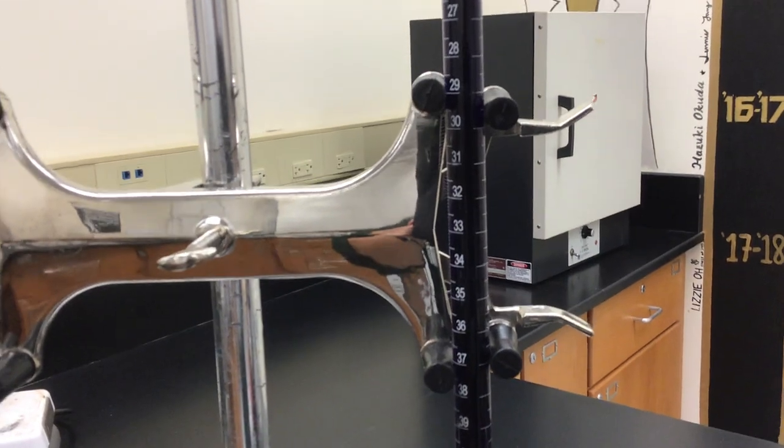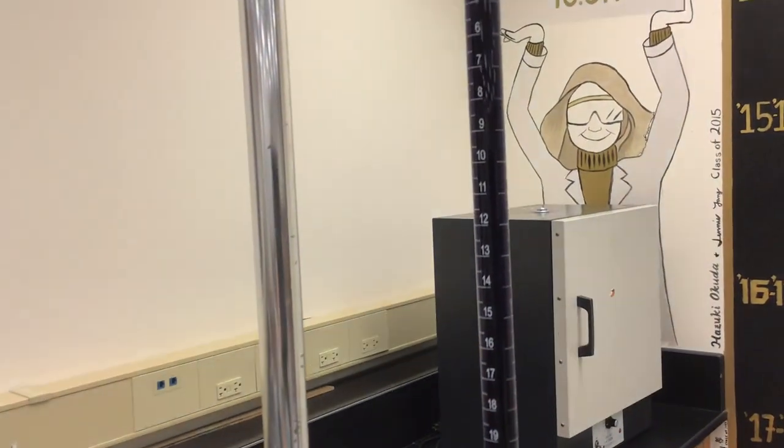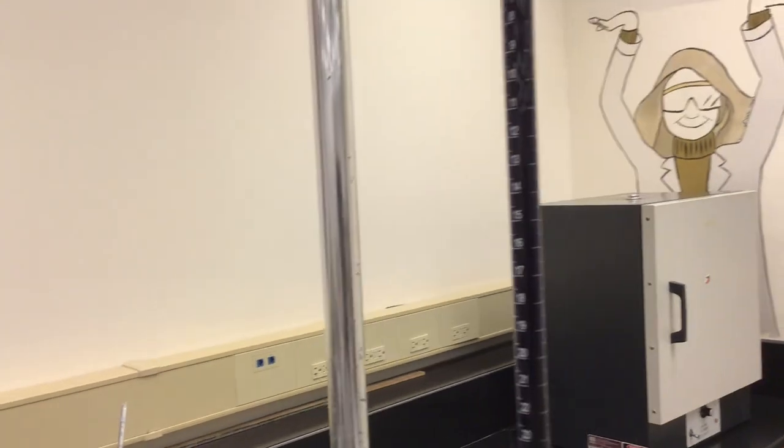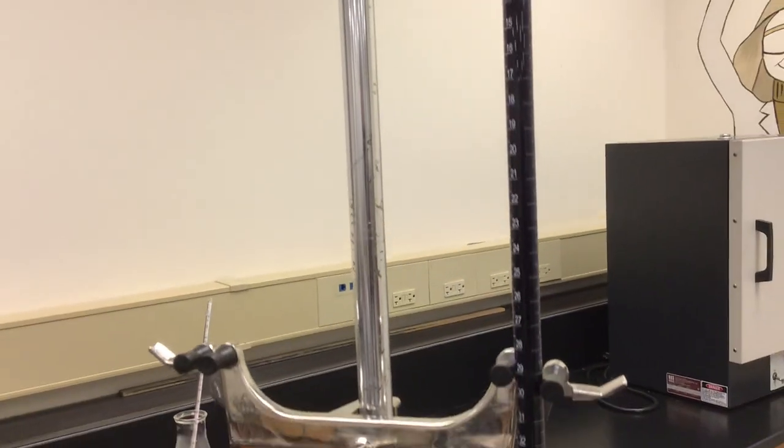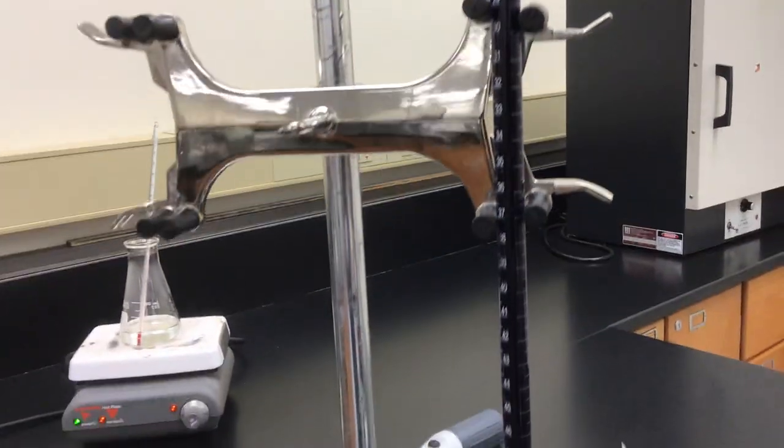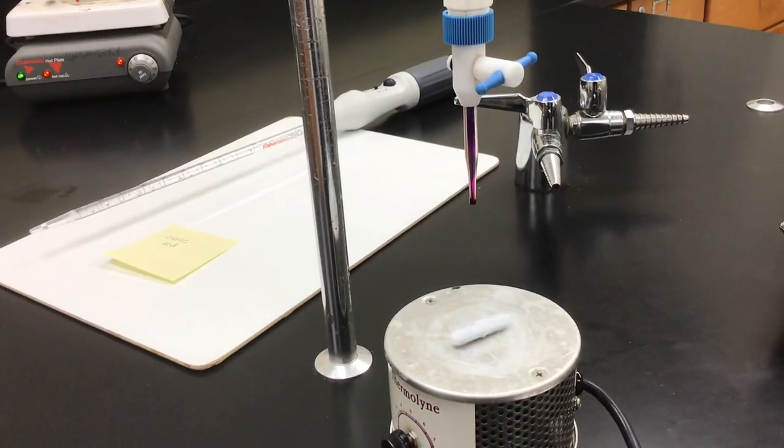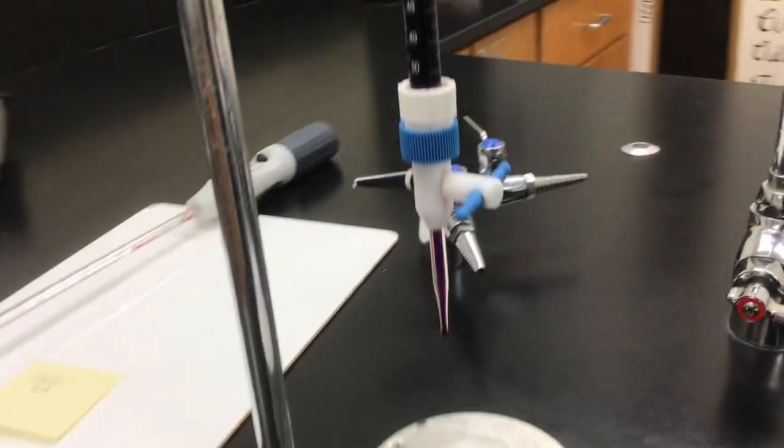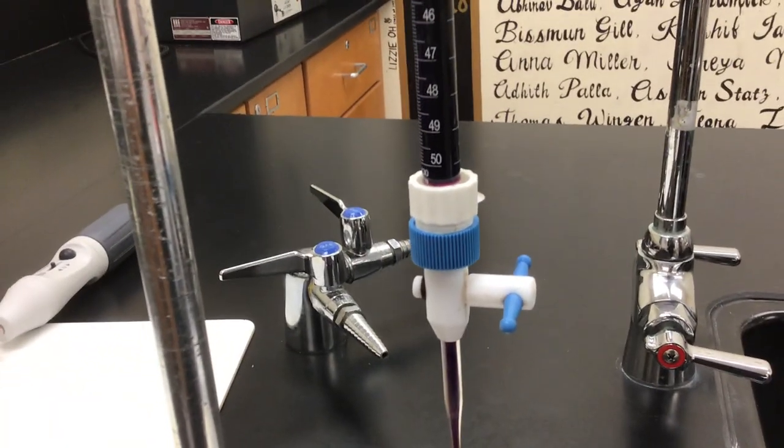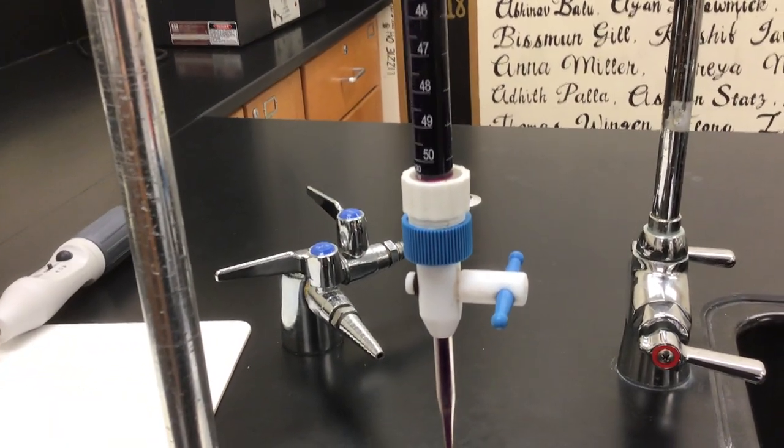The reason why that is, is because when this burette is completely full, zero milliliters of our potassium permanganate solution would have ended up in the flask that will eventually be down below. When we hit the 50 down here, that means that 50 milliliters has been added.